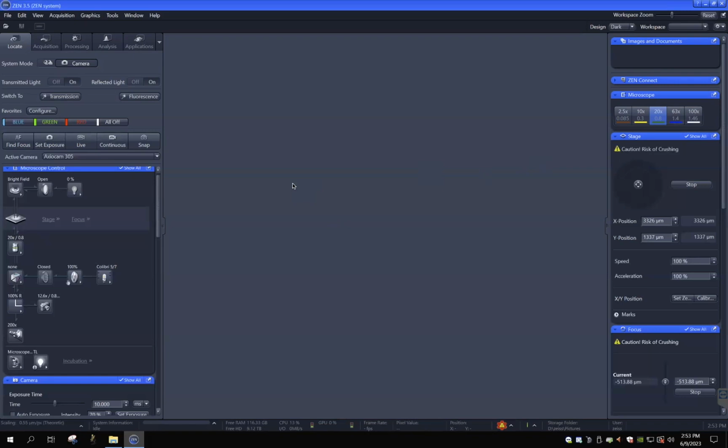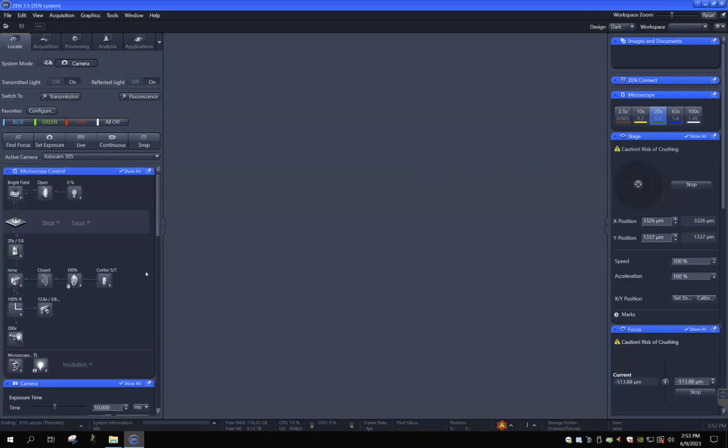So once you set up the calibration chip, we want first to find out where the exact location we want to look into. So what we are going to do is take the wide field of the image. So how we're going to do that here? We can look at the microscope control panel over here.